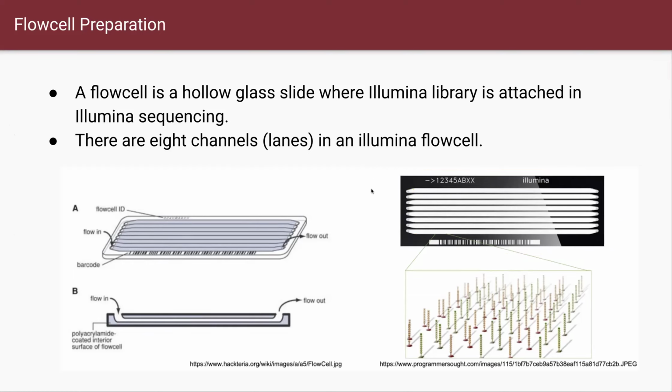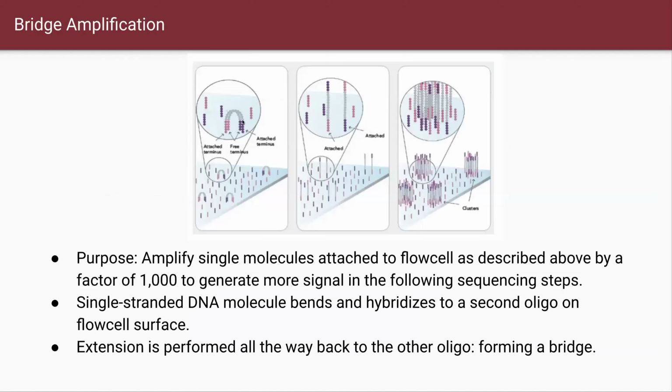And each library binds to the complementary sequence throughout the adapters, right? So once you get the double strand, you have to separate that. But before you separate it out, you first do the bridge amplification, right? So literally amplification through bridging. So why do we need it?